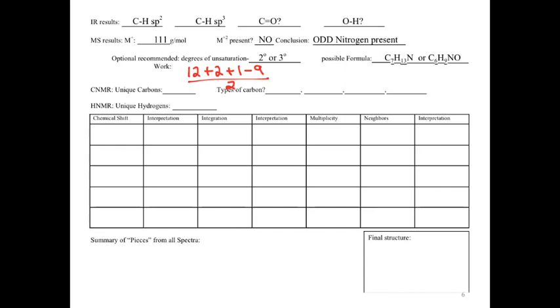So oxygen ultimately, while it takes a spot, it doesn't really take a spot because you could put a hydrogen on the other side of it. The nitrogen we have to account for because when it takes a spot, it actually gives in 2 hydrogen spots. So we get an increase of 1 extra hydrogen per nitrogen. So that's why we have to account for it.